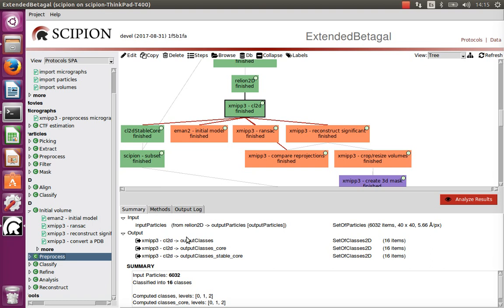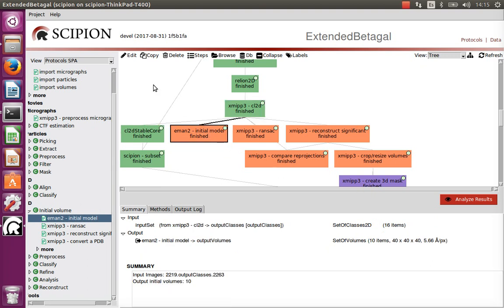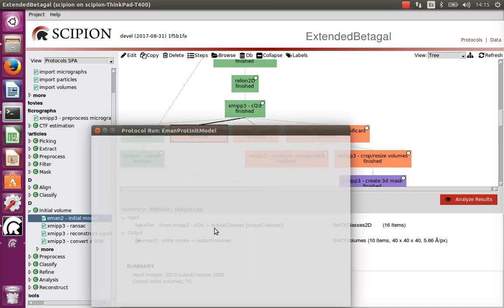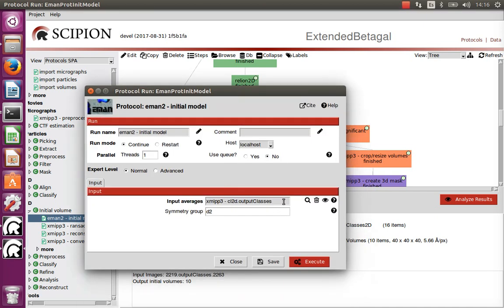It is better to construct your initial model from the data you have collected. For this purpose there are three algorithms: the one in EMAN, RANSAC, and reconstruct_significant from XMIPP. These algorithms are relatively simple — the input is just the set of class representatives you have calculated, and if you know the particle has symmetry (in our case it is a D2 symmetric particle), you also provide that symmetry.